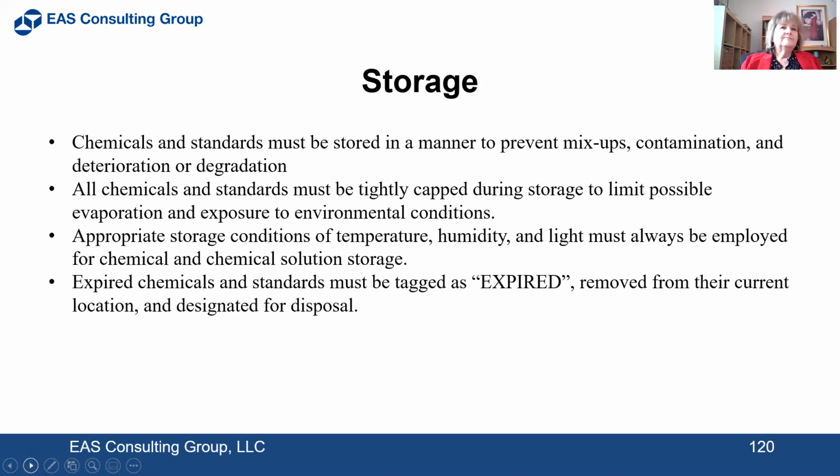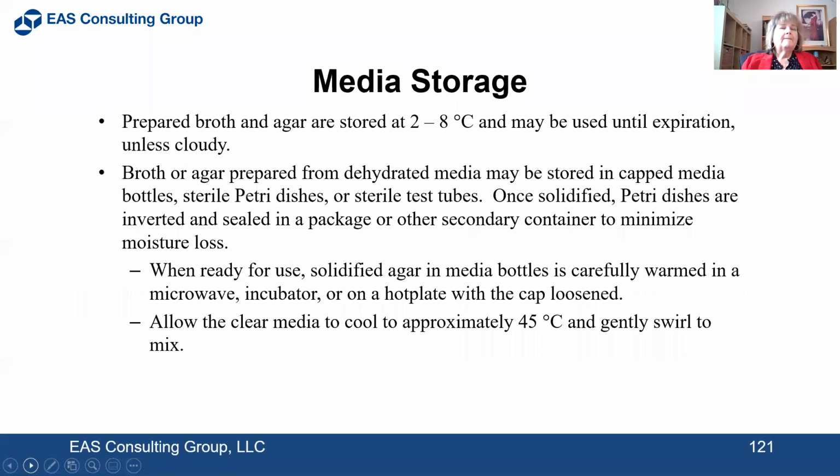When you leave chemicals that are expired in the general use area, we all know what happens next. Somebody's going to use it. Then there's going to be an investigation.